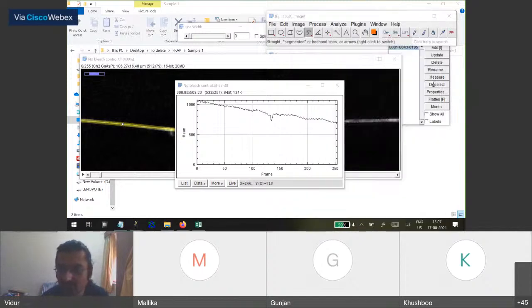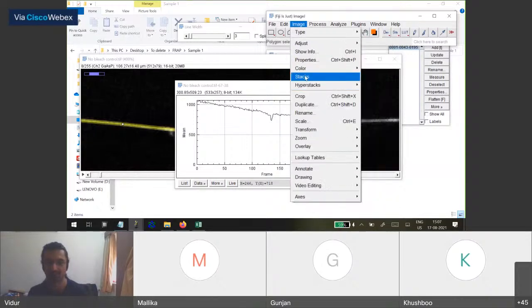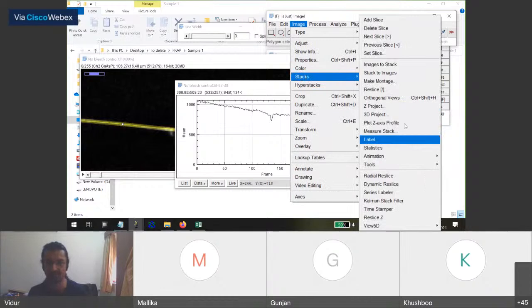And the second question is, would you please show once again how you generated the plot? Oh yes, that's the thing that I just showed. I'll just pause over there so that others can follow. So it's here. That's plot z-axis.